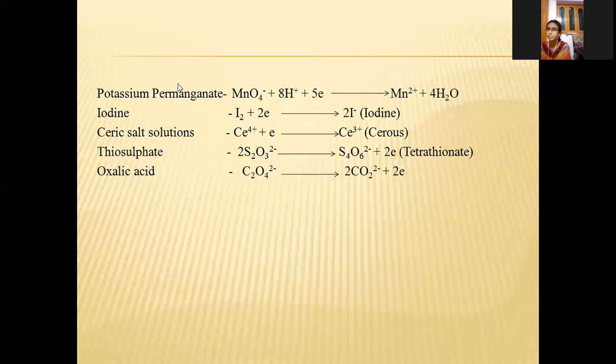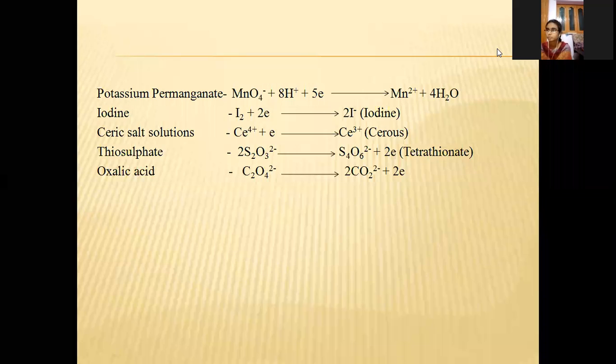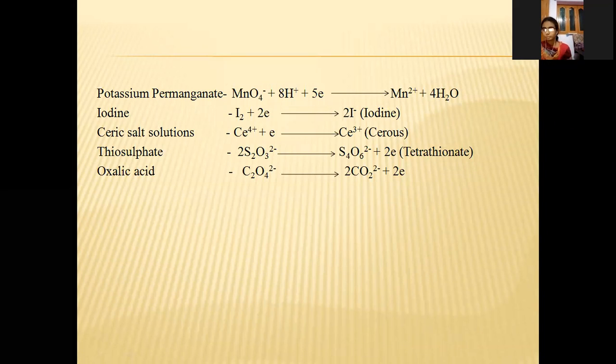The first example is potassium permanganate.